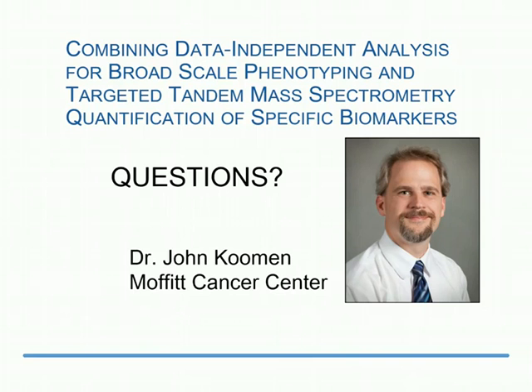I mean, the maximum time of any LC-MS experiment is going to be determined by the limit of the chromatography that you've selected, so your ability to apply a really long flat gradient to the particular column set that you're using. In our case, it's really a practical limit. We have an instrument here that's shared by a number of research groups, and there's certain amounts of time that we would like to be able to complete these studies.